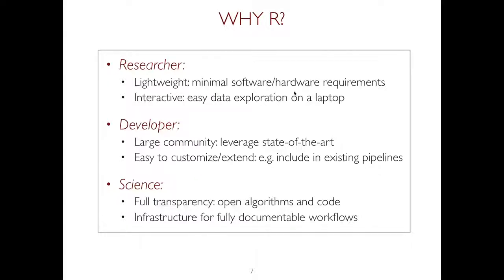You can do data exploration on a laptop, and since we take as input process data, these are relatively small files in many cases, so it's actually quite easy to deal with. For us as developers, it is really nice because we rely on a very broad community of statisticians who can contribute technical libraries for different aspects of things that we need to rely on, which means that we're not a very large group, we're a fairly small group, but we can leverage the developments in the statistical community and bring them quickly to the community of mass spectrometry users.